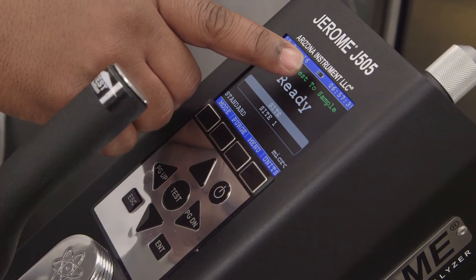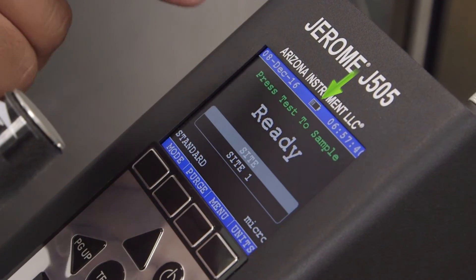Once the main screen appears, take note of the battery indicator at the top center of the screen. If the battery is low, simply plug your Jerome unit in, and in three hours it'll be fully charged and ready for use.